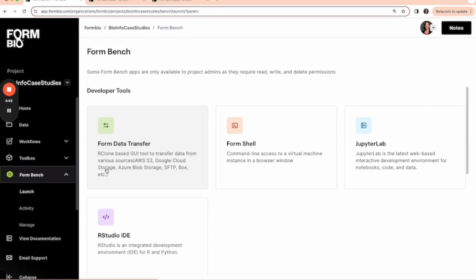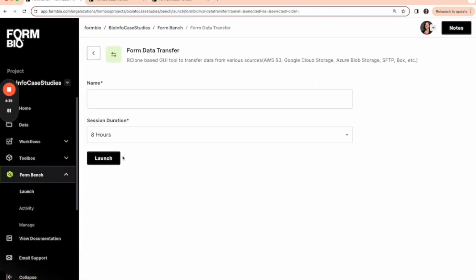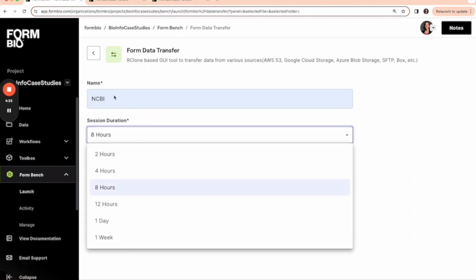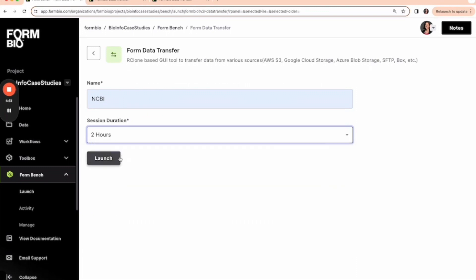This will allow us to select an instance type, in this case Form Data Transfer, and create that instance with a name and a duration time. Then we just click launch.